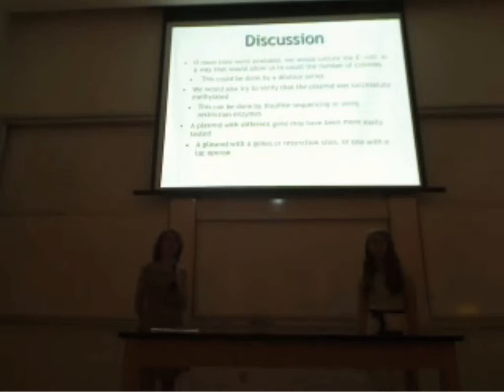A huge amount of our research time was spent actually looking for the correct plasmid to use, one that would have the right genes and the right properties to give us results that were understandable. If we'd had a little more time and gone a little more into that, we might have chosen a plasmid with different restriction sites or perhaps with a lac operon, which would have allowed us to do testing in terms of the bacteria's ability to metabolize lactose.